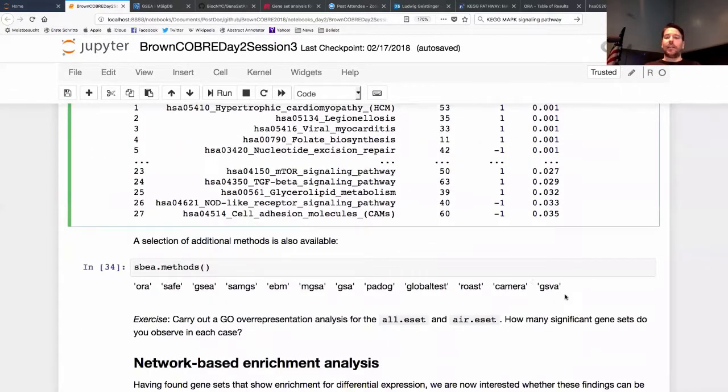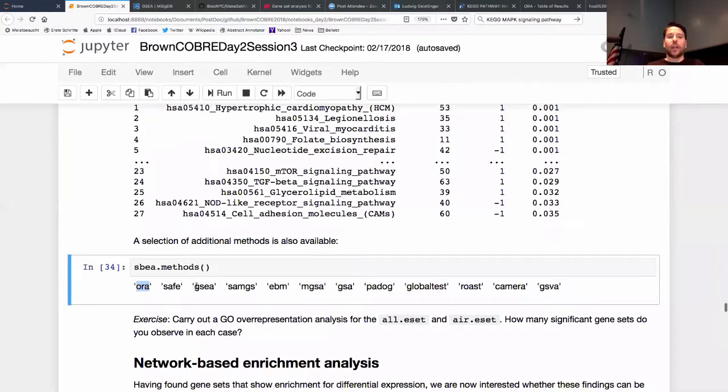And as I said, and Levi introduced this in the beginning, there are a lot of methods available, and we are also currently analyzing how they perform in benchmarking. But just for you here as an overview, we took a look at these two methods and a bit on this one, but there are also a number of other methods available here.